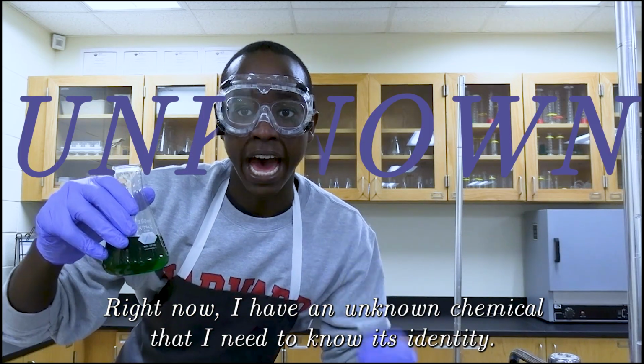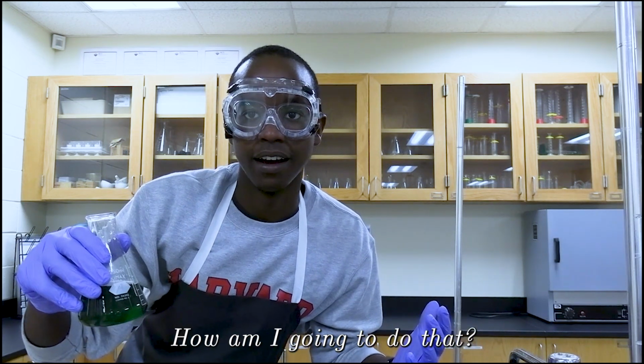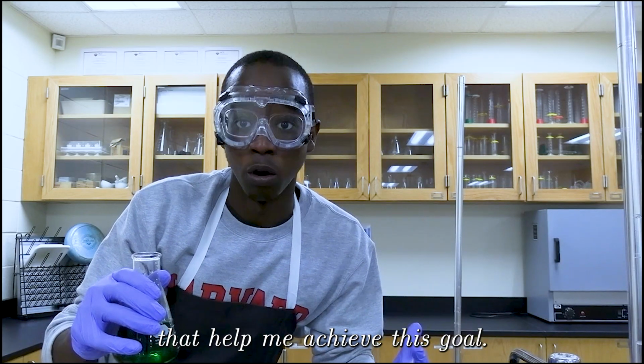Right now, I have an unknown chemical that I need to know its identity. I know you might be wondering, how am I going to do that? Well, there's this instrument known as a mass spectrometer that helped me achieve this goal.